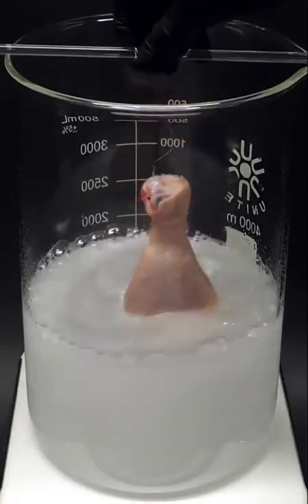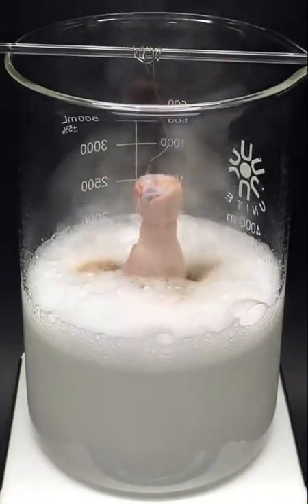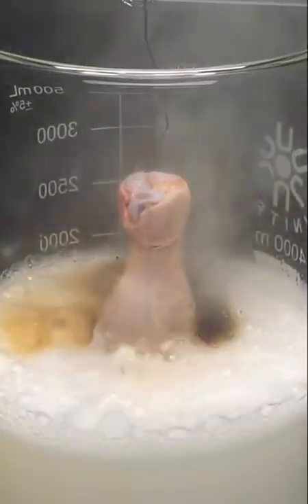and I'll just carefully lower it in. Almost immediately, it started bubbling, and the reaction slowly got more and more violent.